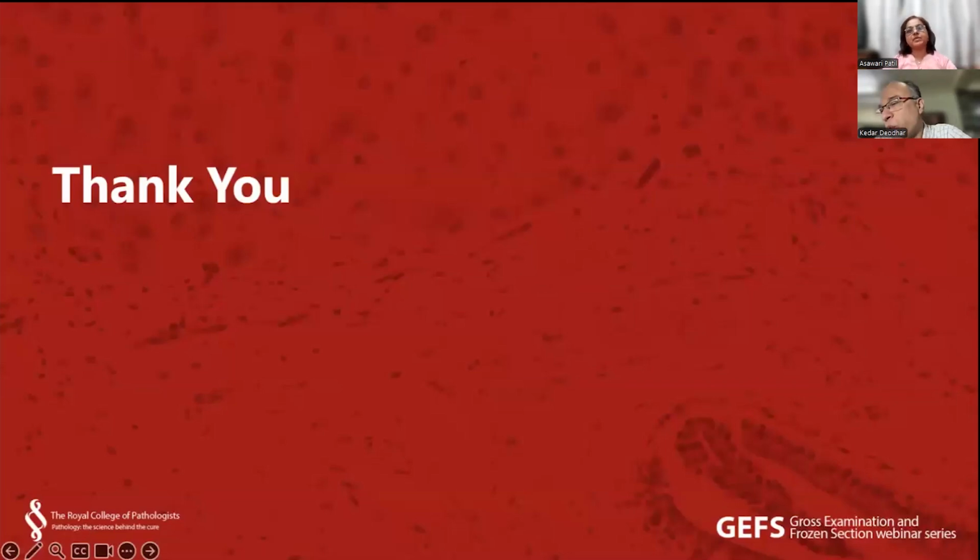Okay. The other question is, when we have an additional separate margin along with the main excision specimen, and this additional margin is a very thin or flat piece of tissue, do we dissect it or do we embed it fully? So when there is a flat margin, try to identify if it is inked by the surgeon. If it is inked by the surgeon, the embedding should be done in such a way that the ink is on one side and the rest of the tissue on the other side. If it is not inked by the surgeon, preferably submit the entire tissue. How to embed it is important. The ink surface, as far as possible, should be on one side so that we can see the tissue and ink surface, and identify the distance of the tumor from the ink surface.